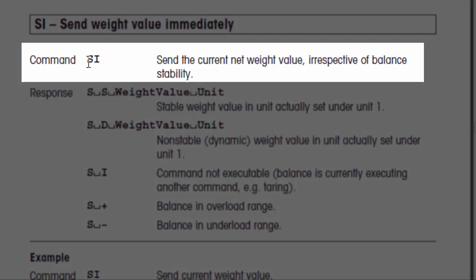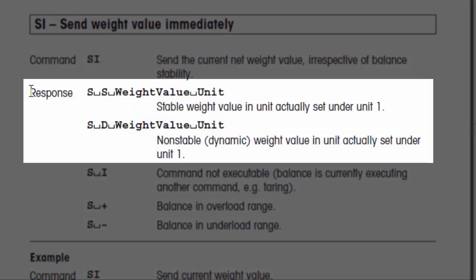To send the command, we're going to send to the scale a capital S and a capital I, and of course we're going to terminate that with a carriage return and a line feed. That tells the scale to send us the current net weight value whether or not the balance is stable. Once we've sent that command, the typical response we could expect to get back is: capital S, a space, another capital S, a space, then the actual weight value, followed by a space, and then the actual unit. That would be terminated by a carriage return and a line feed, and that's the response if the weight on the scale is currently stable.